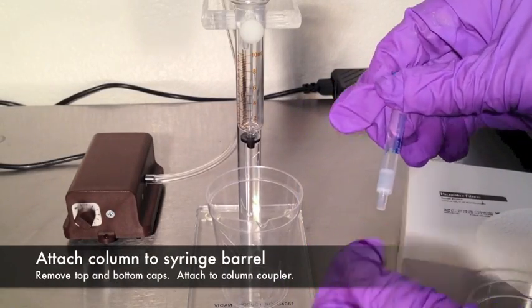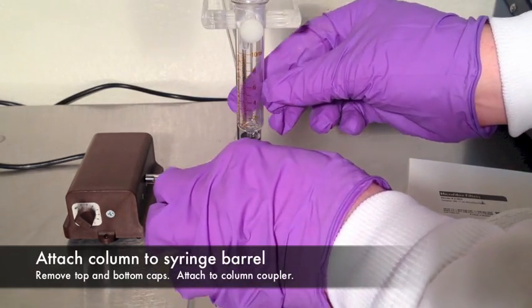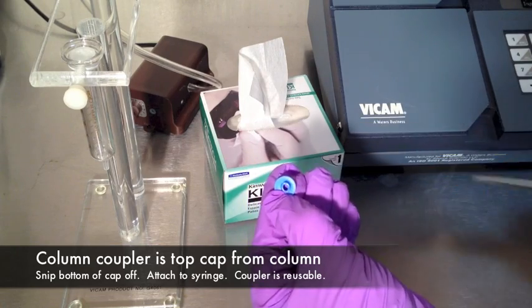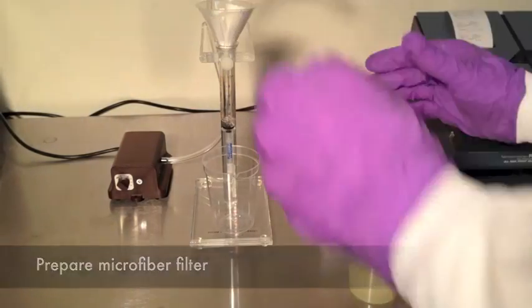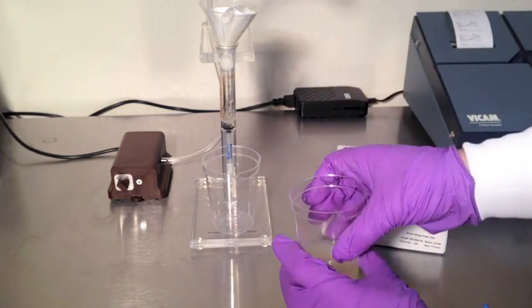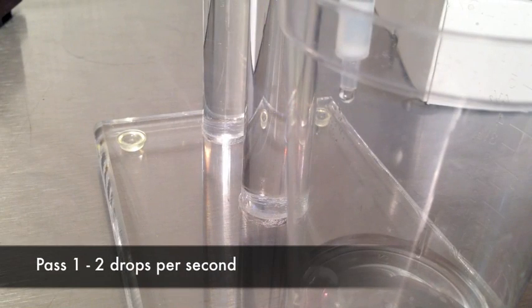Column chromatography. Remove the top and bottom cap from a new AFLATEST column. Attach to the syringe barrel in the pump stand. To create a column to syringe coupler, cut the bottom off of the top cap of a test column and slip onto the end of the syringe barrel. Place a waste collection cup below the column. Prepare a glass microfiber filter and funnel. Use the markings on the syringe barrel to measure 2 milliliters of diluted solution. Apply air pressure to the syringe and pass the extract through the test column at 1 to 2 drops per second until air passes through the column.